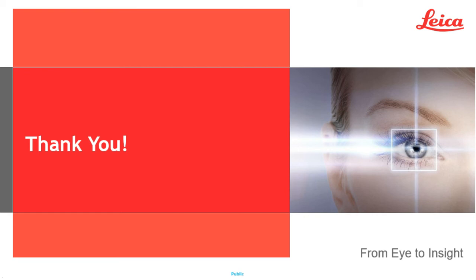The denoising model that you saw was created from 10 image pairs. So basically we fed pairs of low signal to noise and high signal to noise, and there are 10 of those sets. The EM segmentation gets a lot more complex and takes a lot more data. So it varies quite a bit.